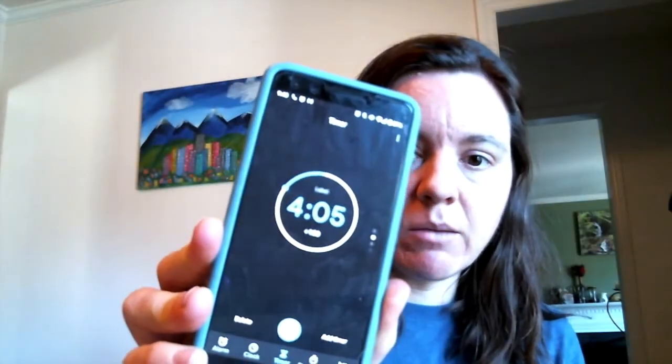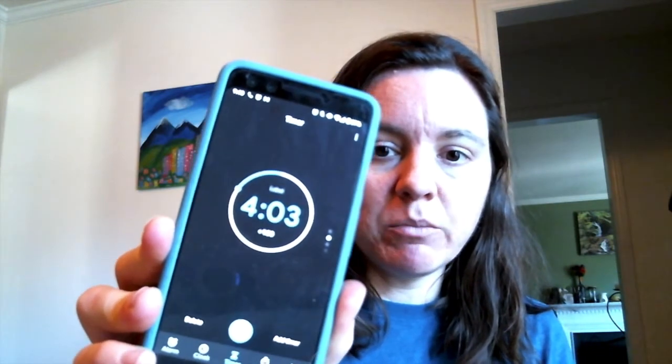Okay, so my phosphate tablet dissolved, and there's still some solids in there, and that's okay. So I set a timer, and I'm gonna wait 5 minutes and let that color develop like the directions said, and then we're gonna use the color chart to read our results.